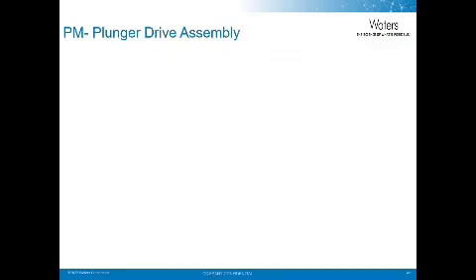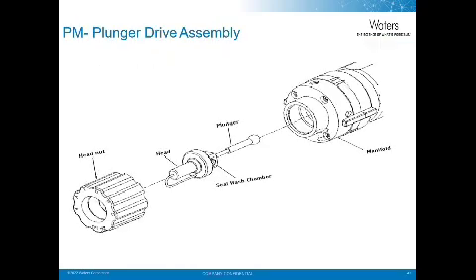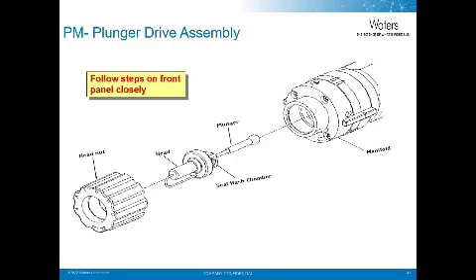Shown here is an exploded view of the plunger drive assembly. When PMing, make sure to follow the steps on the front panel closely. Make sure you read, then perform the task. When changing the check valve cartridge during the PM, make sure that the arrow points up.